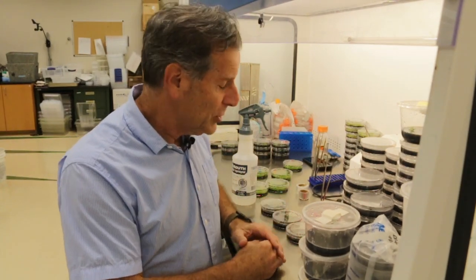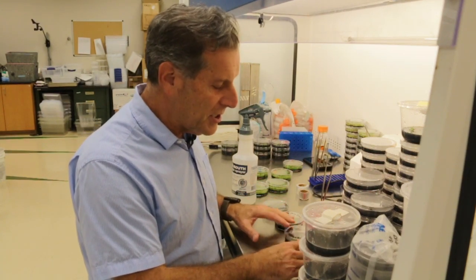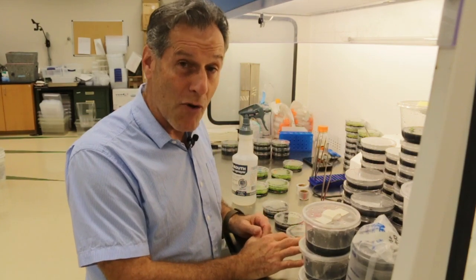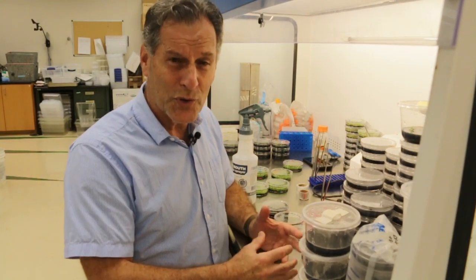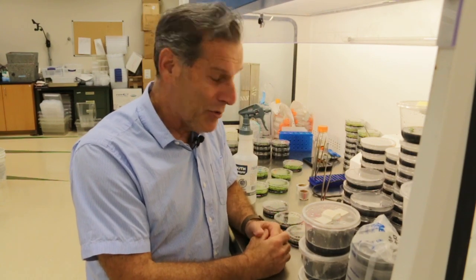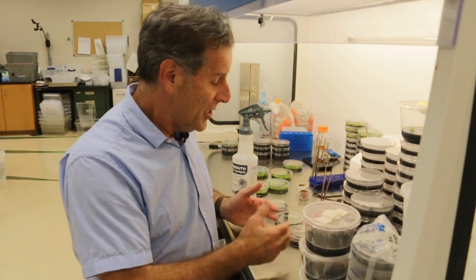Anyway, I've always loved carnivorous plants. I've always grown them, either in my collection or in the laboratory. I just wanted to share some really early results growing these Nepenthes in the laboratory. They're starting to do well. I'm going to wait for them to get big, and I may turn some of these over to the person who supplied the seeds. I may also try adding them to my orchid collection — you see Nepenthes for sale in local stores. They're really beautiful and interesting plants, and I've got plenty of them here.